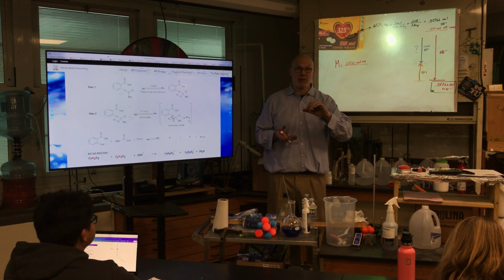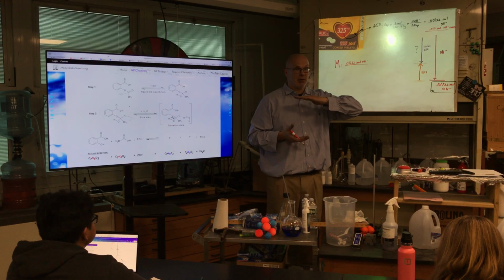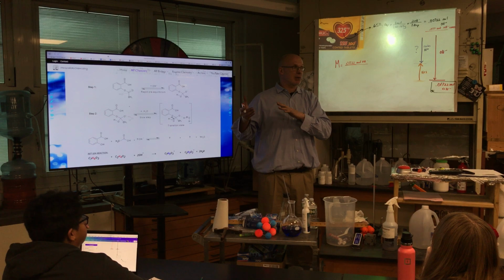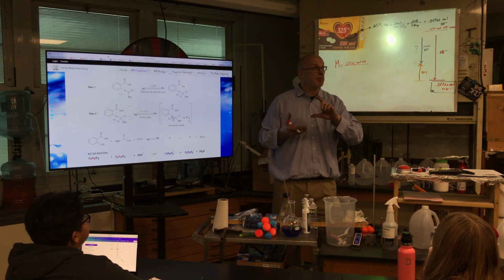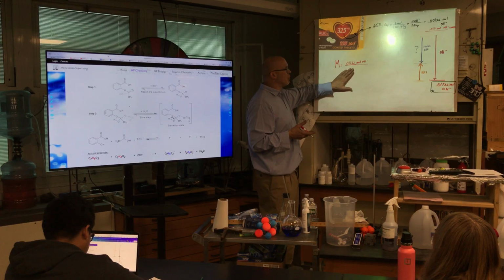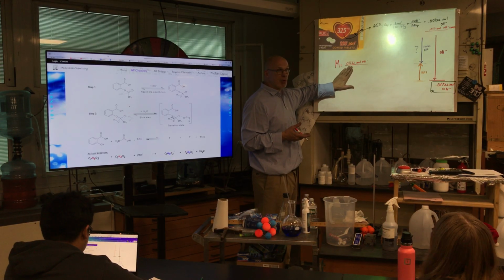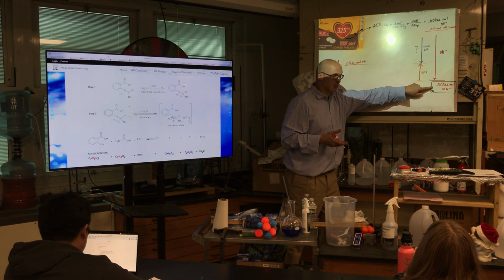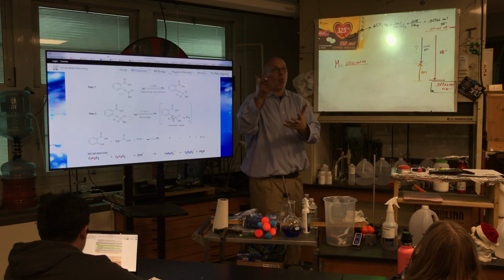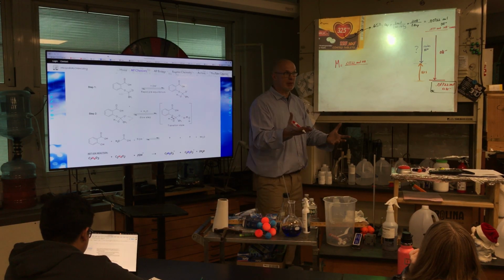I have to use part of it. So yesterday I said, we're gonna make 100 milliliters of a solution. We're gonna use 20 milliliters of it to standardize. Probably just need 12 or 13, okay, but we're gonna use part of it. So we made a molarity. I wanna drop that many moles as my guide right now, and I wanna use how much? If I'm gonna use 20 out of the 100, how much do I have left? 80.